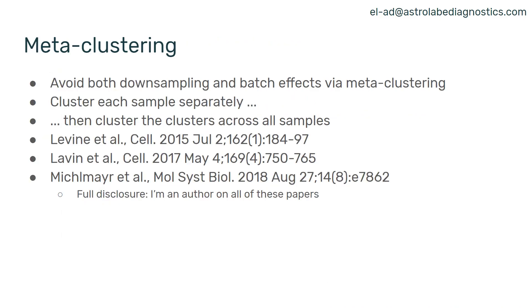One solution for addressing this is metaclustering. Metaclustering is a computational technique that avoids both downsampling and batch effects. The way it works is you cluster each sample separately, effectively eliminating inter-sample batch effects. You end up with 20 or 30 clusters per sample — way too many to annotate — so you can then cluster the clusters across samples and end up with 20 or 30 metaclusters, which you can annotate and then apply back to the original samples.